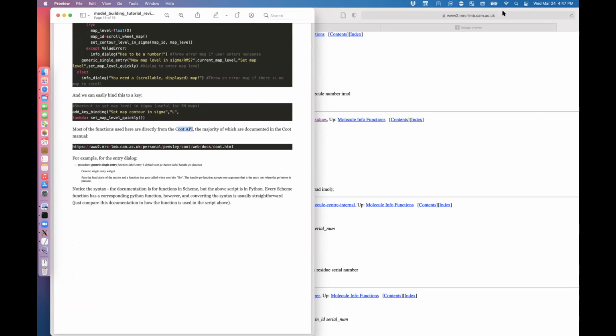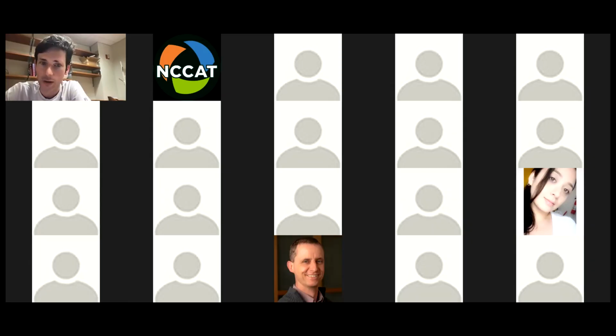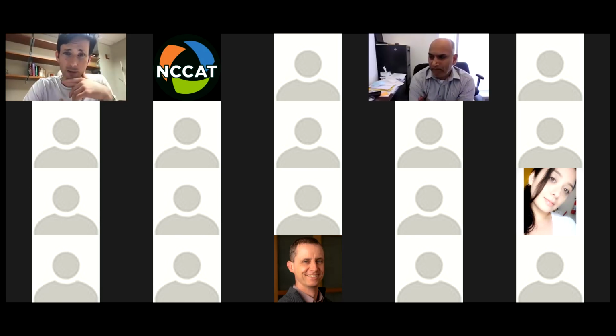Okay, so I'm a little bit early, but that's all I have for now in terms of the tutorial. So if anybody has any questions or particular situations regarding their data or anything else that they want to discuss, now would be a good time to do that. I hope this was in some way useful and made a good deal of sense, and that people are following along to a degree.